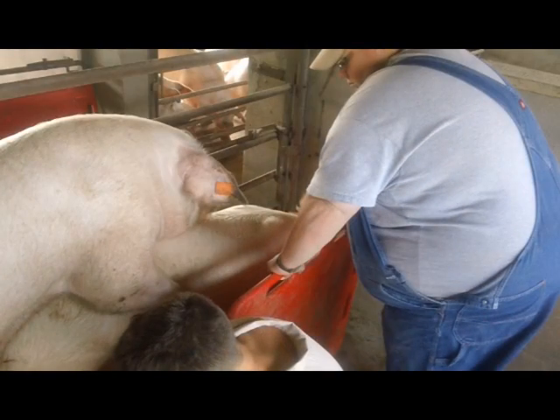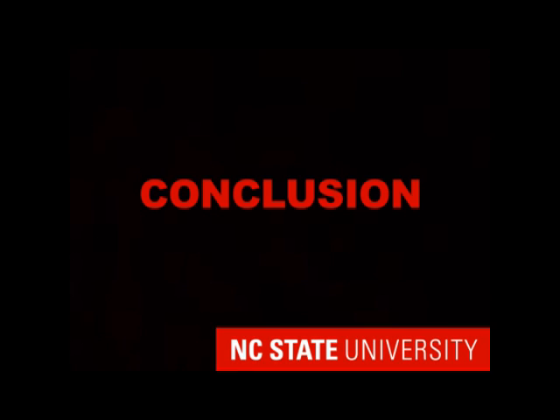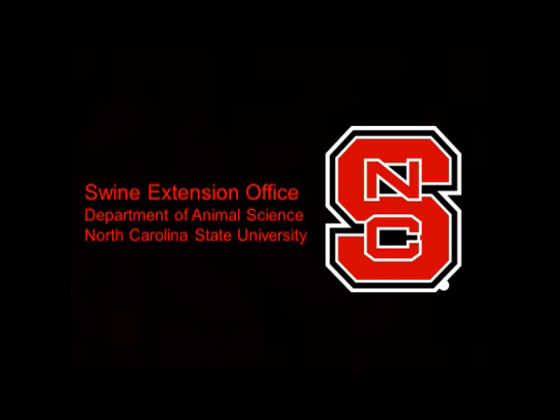If you can, have the sow face into a corner or have someone else hold a sorting board to block her position and help keep her in one spot throughout collection. A good boar kept on a regular collection schedule can be a positive asset to any breeding swine farm, and dummy training and collecting can be done easily so long as we always remember to be patient and to keep the right grip throughout collection.